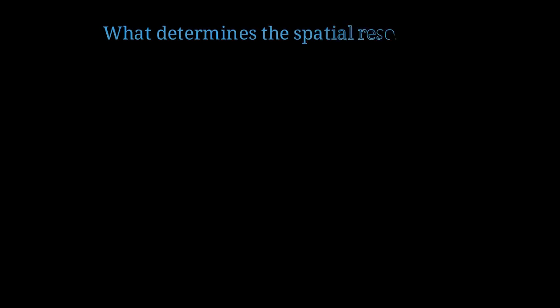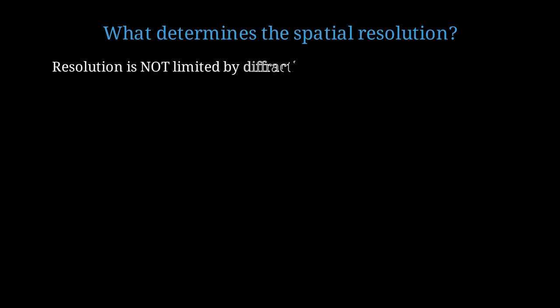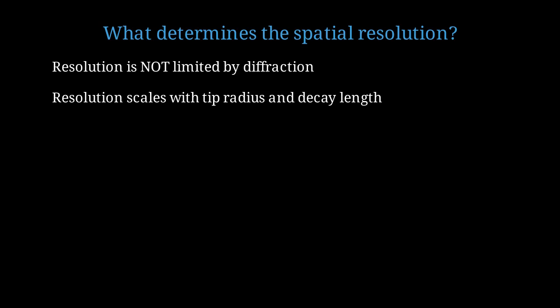Let's ask an important question. What ultimately determines the spatial resolution of the STM? Is it limited by the wavelength of the electrons? Unlike optical microscopy, the STM is not limited by diffraction. The resolution is determined by how sharply the tunneling current is localized to the tip apex. The lateral resolution is approximately the sum of the tip apex radius and the decay length. With an atomically sharp tip, this can be well under 2 angstroms.